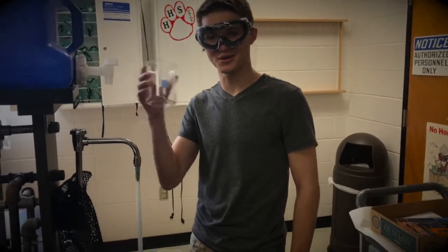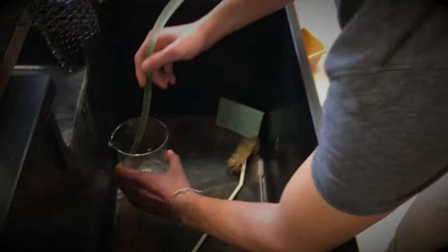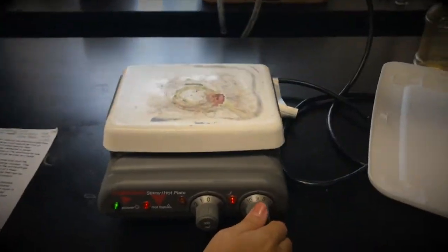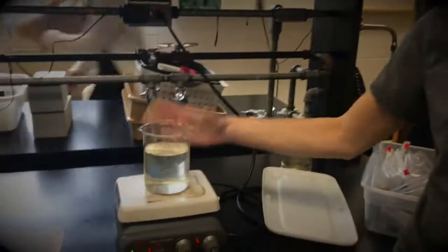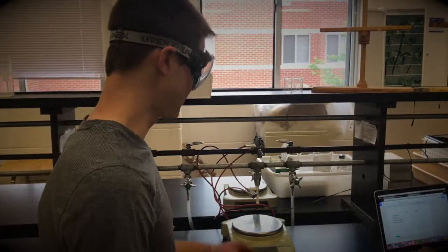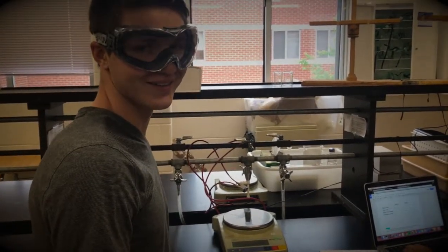Step 1. Gather all your equipment as stated above. Step 2. Fill beaker about 2/3 full of water, around 600 milliliters. Turn hot plate on to dial 9. Then put the beaker on it. Weigh metal 1. Record and chart.